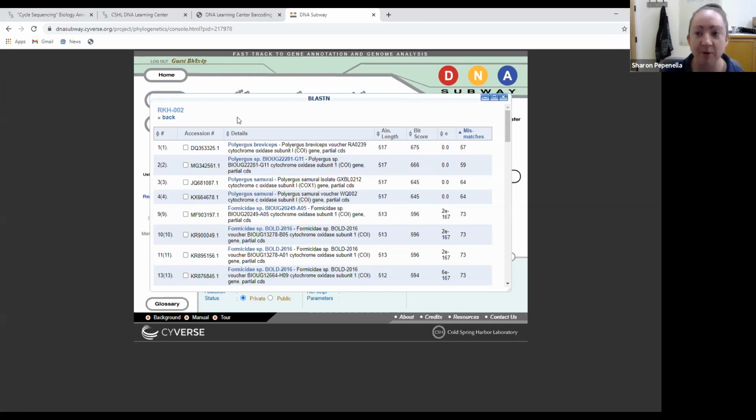Well, for this particular sample, we had a taxonomist identify these samples even before they sent them to us. And this individual, John Marlin from Illinois, who sent us these samples, identified this particular sample as Polyergus montevagus. So obviously that's not the closest match that is available in GenBank. So I went ahead and looked in GenBank to see if there was sequence data available on Polyergus montevagus. Does this have high polymorphisms compared to that one for some reason? In this case, no, there is actually no barcode published for Polyergus montevagus. So this is not only a novel sequence because it's very, very high in the number of mismatches, but it's a completely new GenBank record.